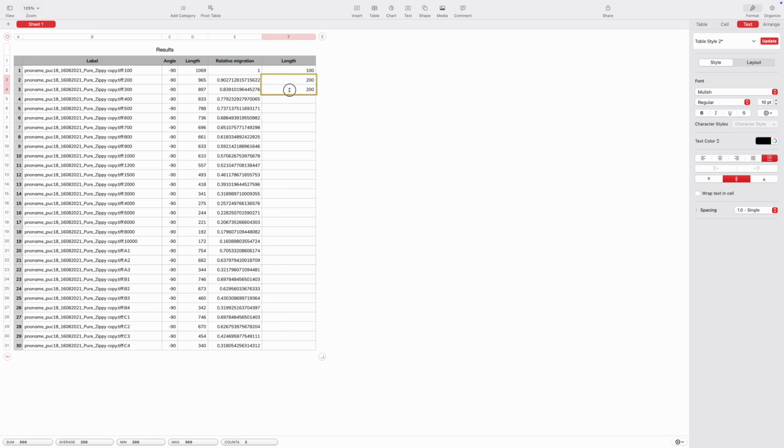Never mind. I'm just going to do this manually. 900, 1,000.